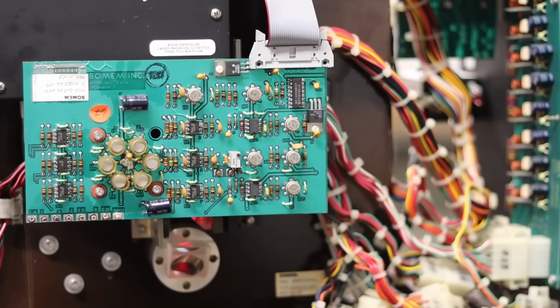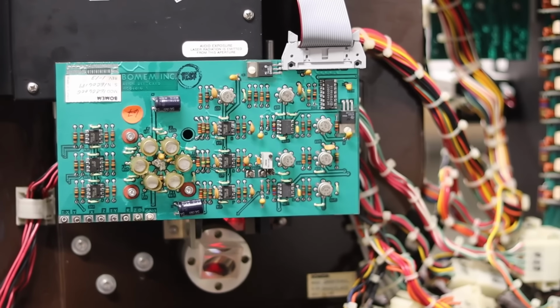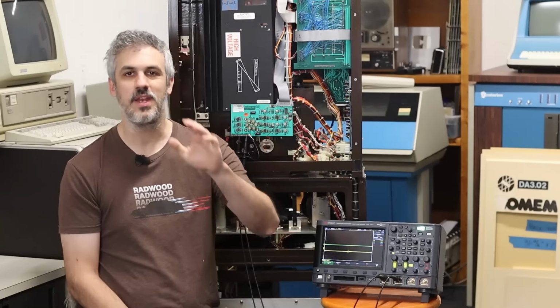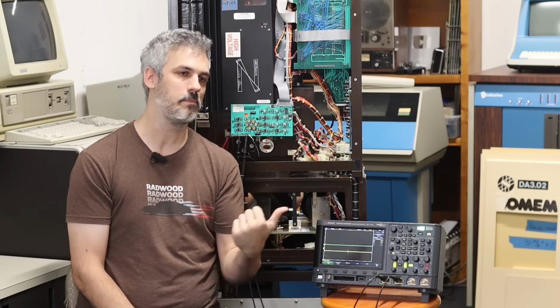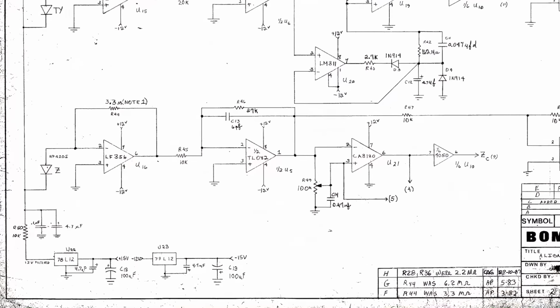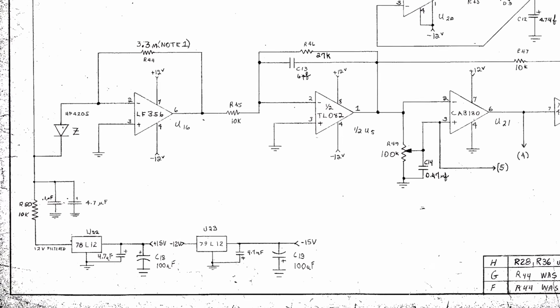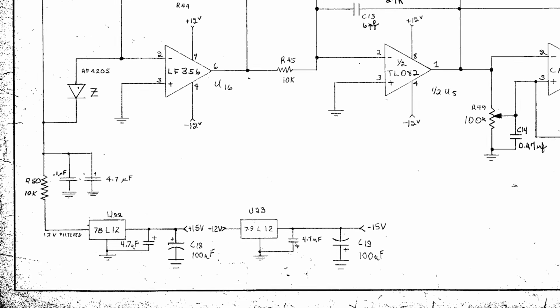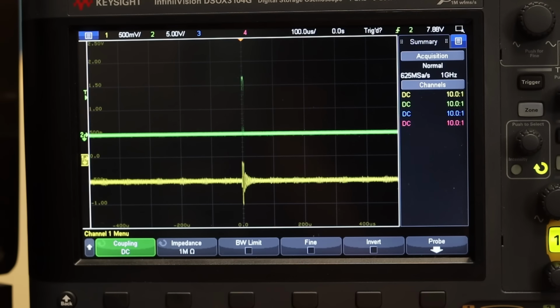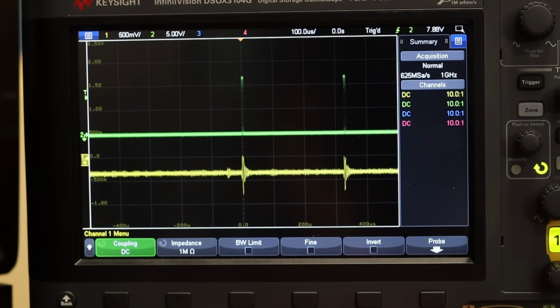The other theory is that the op-amp chain on this board here has a failing part that is injecting noise into the system. Now I can hear all of you guys hammering away on your keyboard furiously saying that it's the Meanwell power supply that I've got bolted to the bottom, but it's not. This board has its own separate power supply and its own separate 0-volt return that's completely different than that 5-volt Meanwell that's up there. And if it was the high frequency noise from that Meanwell, we would expect it to be rhythmic. We'd expect it to have a pattern, and this doesn't have a pattern. So something is unhealthy somewhere.